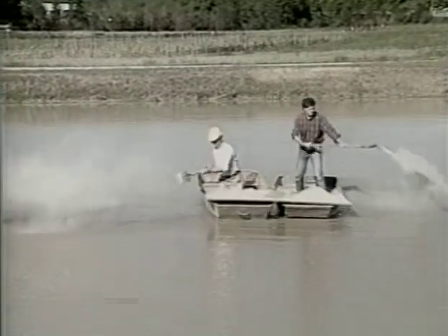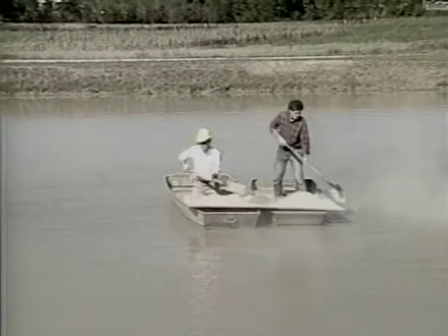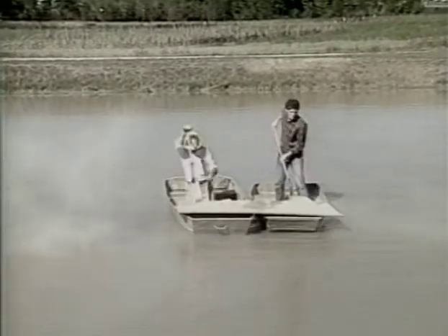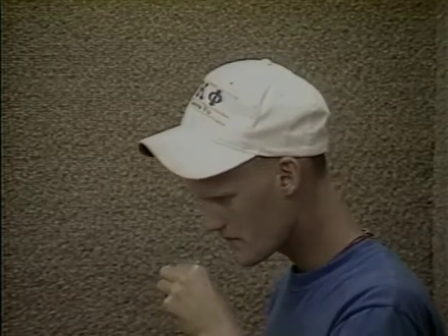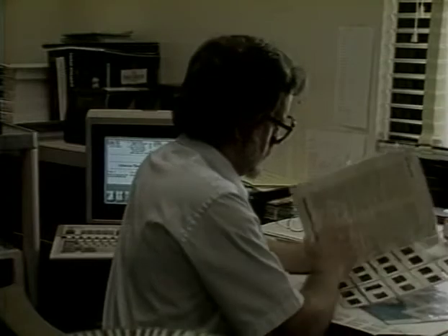Liming to increase pH in this case will usually solve this problem by increasing the buffering capacity of the water, thereby stabilizing pH. Hydrogen sulfide has a distinctive rotten egg smell and may be easily detected in this manner. For further testing, consult your county extension agent.